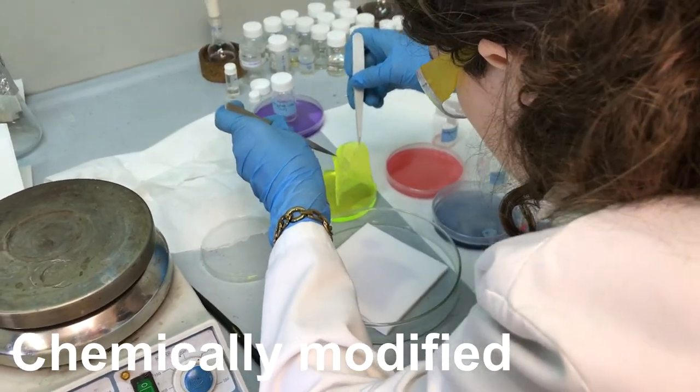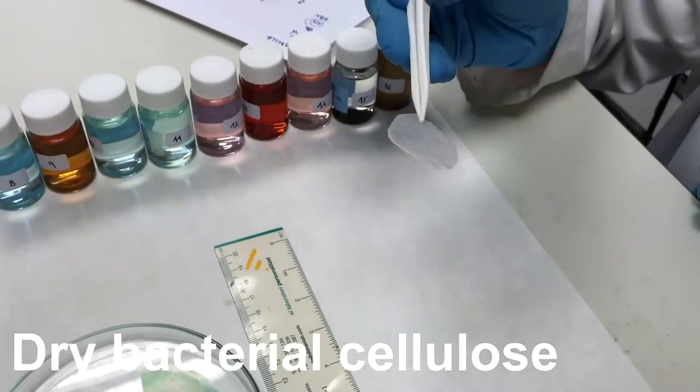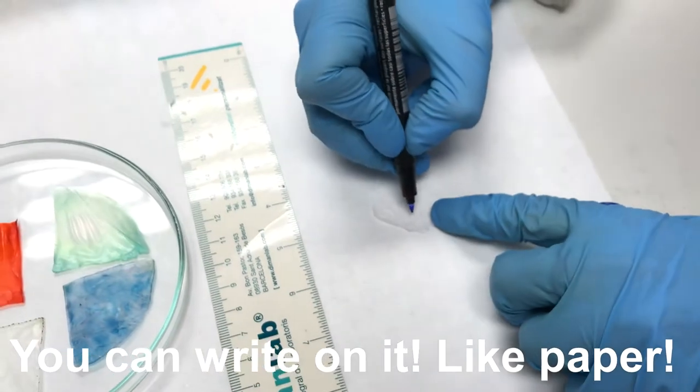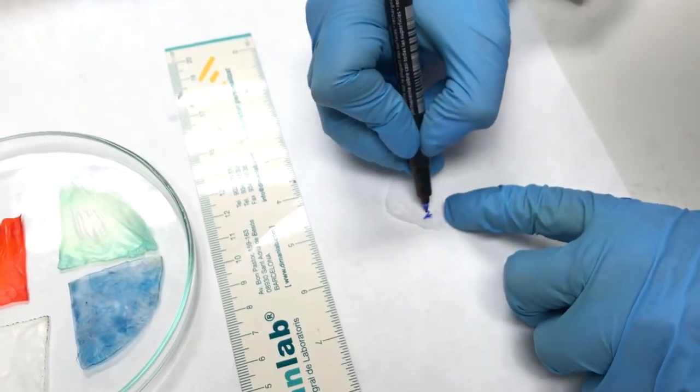Once dried, the cellulose is like paper, a thin membrane. And you can even write on it! That's what we do in our lab. Pure bacterial cellulose.